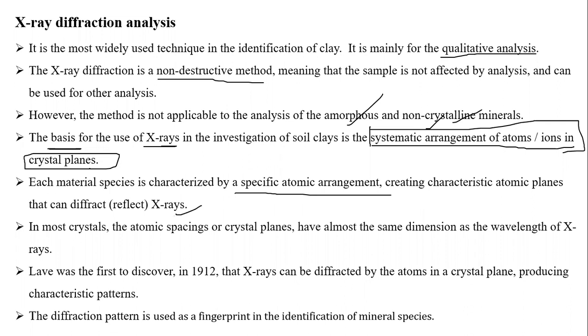In most crystalline materials, the atomic spacing or crystalline planes are almost the same dimensions as the wavelength of X-rays. So the wave nature and the dimensions of the crystal planes are almost the same. That's why we can use X-rays. Very first, Laue, a great scientist, identified this in 1912. So the diffraction pattern is used as a fingerprint for the identification of mineral species.